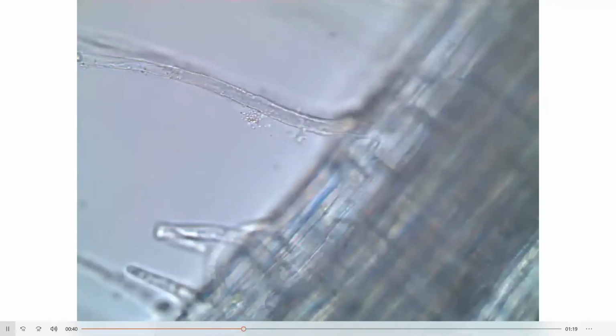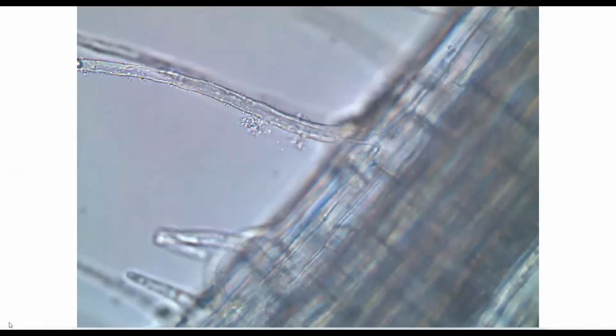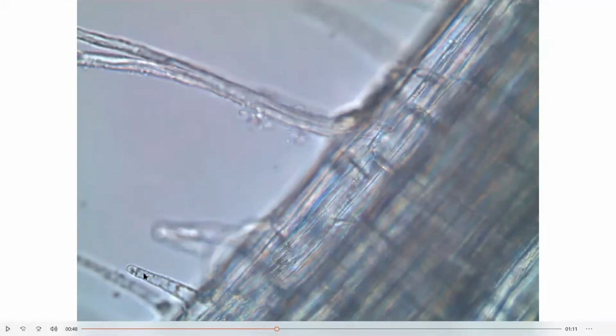So this is a total magnification of 400x, and you can see, let me pause that for a second. Down at the base of the root hair, where it attaches to the epidermis, you can see that this is part of the epidermis, and you can see that the cytoplasmic streaming goes into the cell that actually gives rise to that whole root hair, because it's all just one cell attached there.